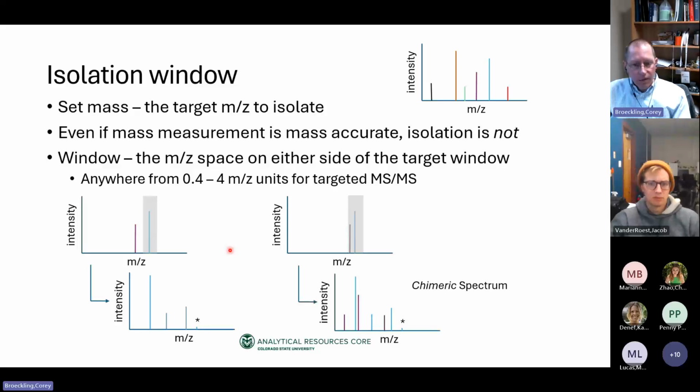This is commonly referred to as a chimeric spectrum. We have multiple fragment ions from one MSMS precursor selection event. It represents 2 molecule fragmentation patterns. And of course, when you get this out, these aren't color-coded. So it can be difficult to know which fragment ions are derived from which precursor. There are ways to do that, but again, that's a very much more complex talk than we're going to cover today.